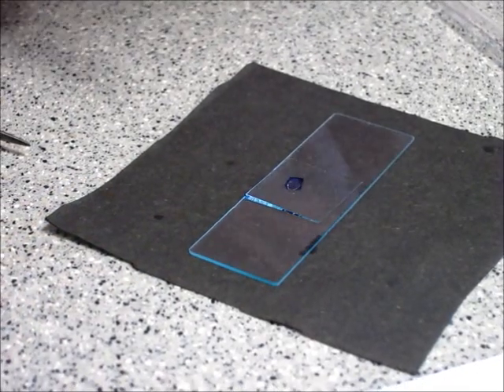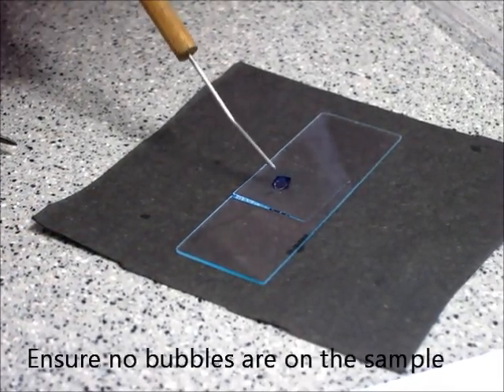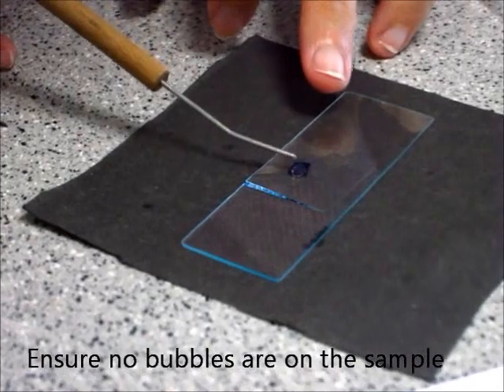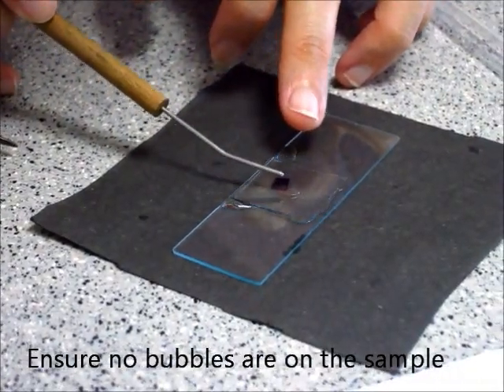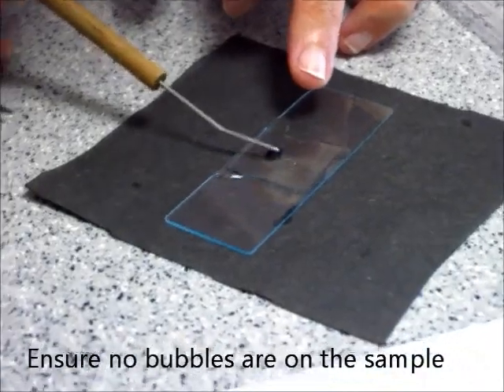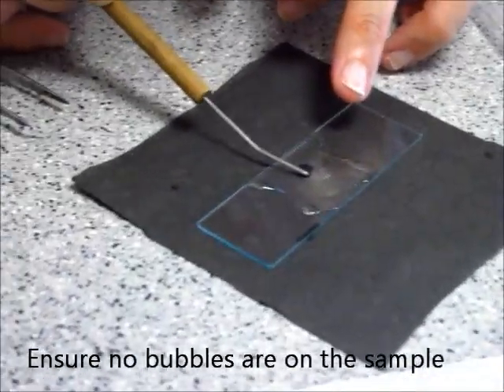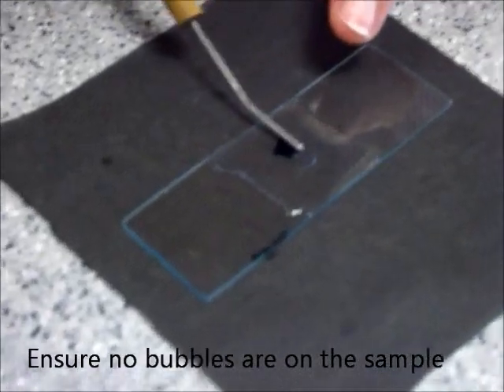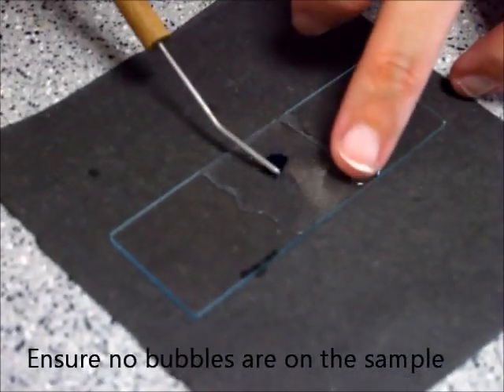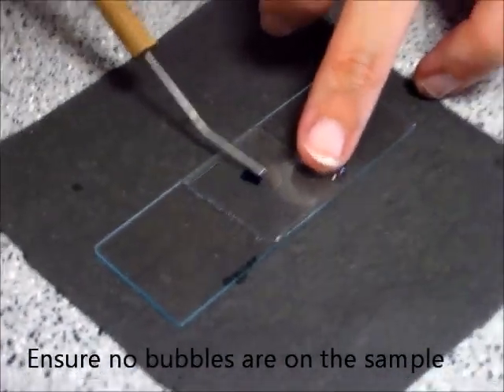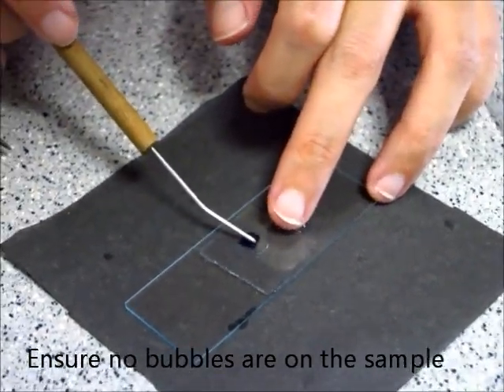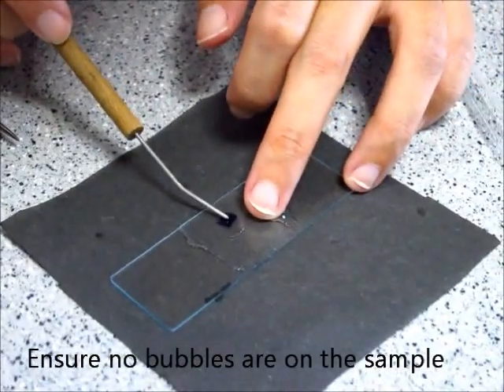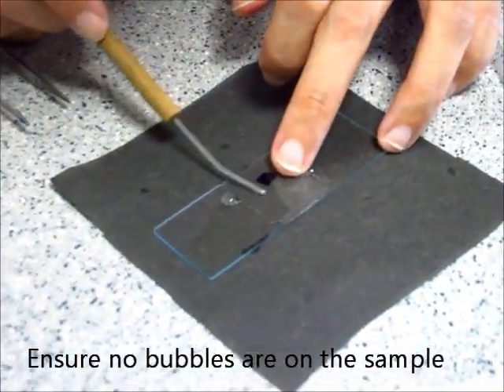But as you can see, even though I was very careful, there's one big bubble over here. So that doesn't matter. I just need to press a little bit, press the sample down a little bit. And you can see the bubble is moving away from the sample. So what is important is that the bubble is not on top of the sample. Let's try to get the bubble away. So now that we've gotten rid of the bubble, you can see there's a lot of water around.